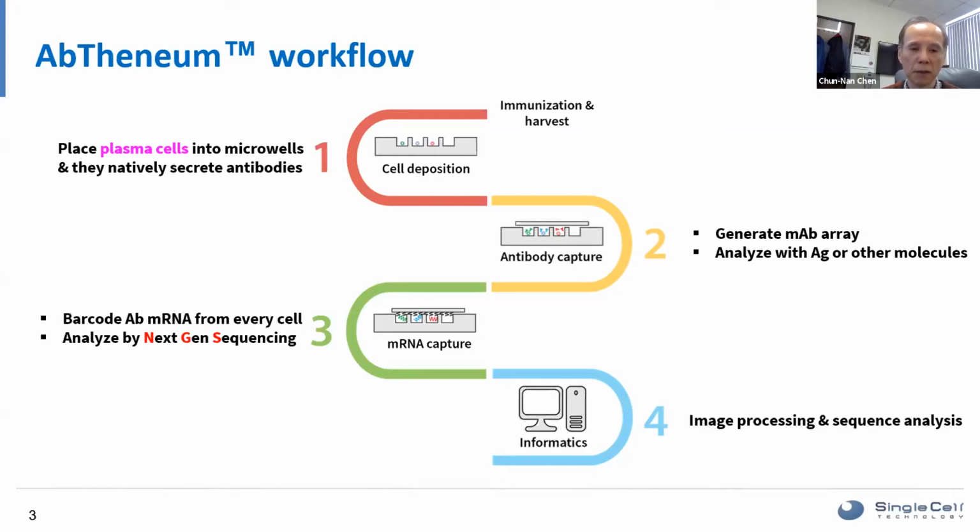So we deposit these cells into what we call the Picoliter device. Where's my mouse here? Yeah, here.